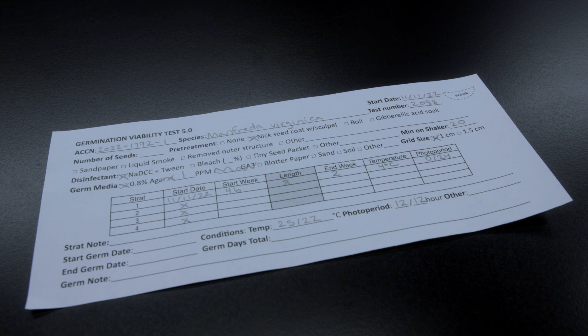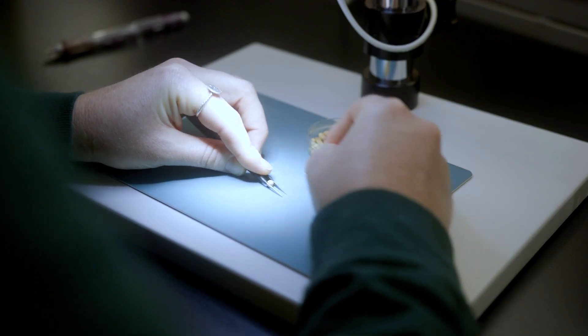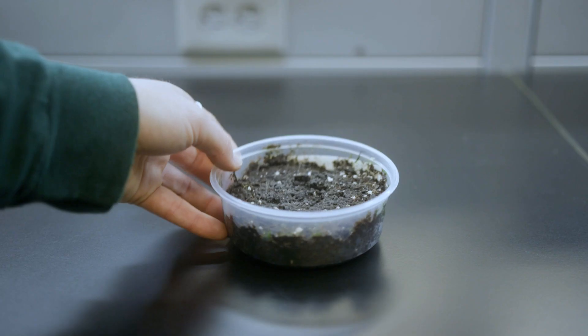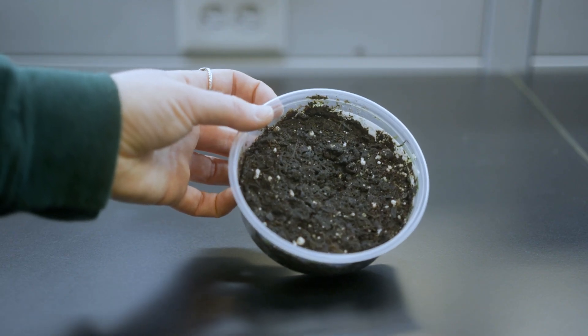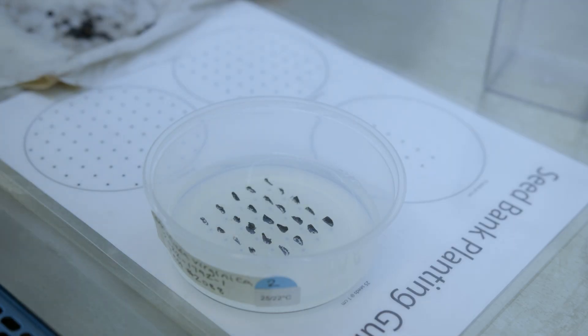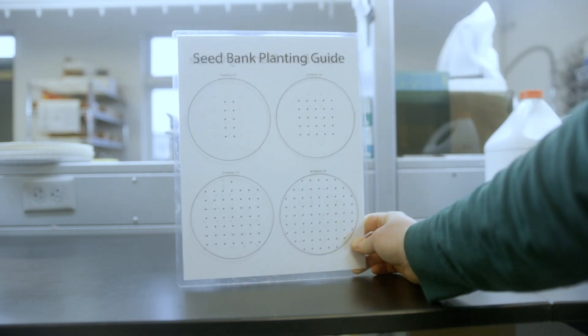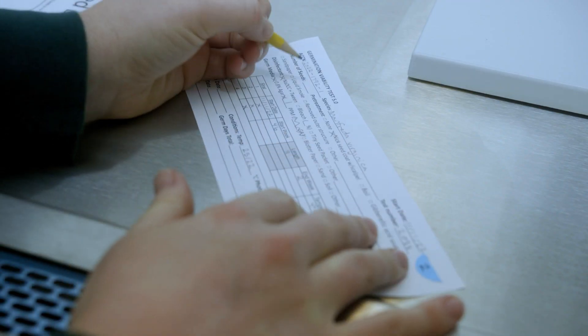Start date is when the seed will be planted. There are spaces to note any pre-treatment, such as nicking seed coats and boiling, method and length of disinfection, and type of media used, which is usually 0.8% agar and if anything is added to the media. After the seed is planted, I go back and note what size grid was used and the actual number of seeds planted.